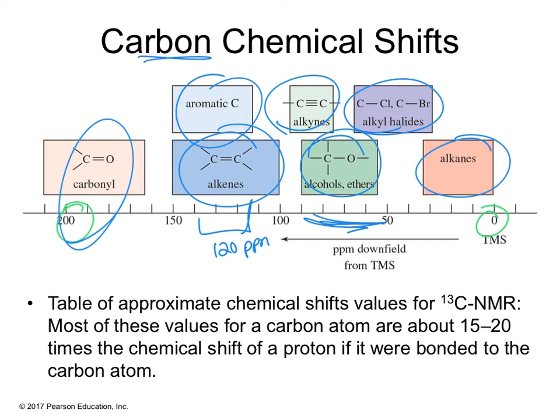Remember, we're looking for carbon now, and a lot of times the carbonyl peaks take a long time to show up. Carbon NMR takes a long time. A lot of times people will sign up for the NMR spectra overnight if they want a carbon, or you have to load maybe 20 to 30 milligrams of sample to get a carbon NMR, because carbon-13 is not everywhere. It's like 1.1% abundance, as opposed to hydrogen-1, which is like 90-some percent abundance.